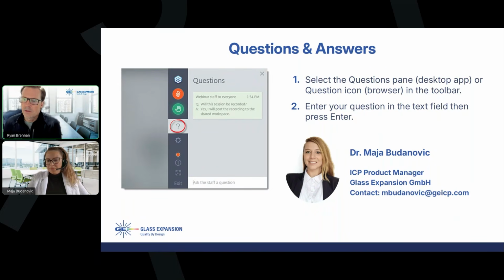Let's see. This is a good one. Somebody has a question specifically about gold and mercury. They're wondering if you could give any advice on measuring specifically low concentrations of gold and mercury. They don't specify whether ICP-OES or ICP-MS, but still.